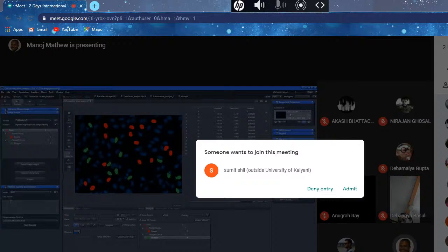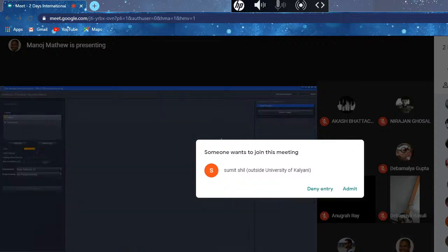So here I'm going to create a new training model and let me call it HeLa cells. This is my segmentation model. Here we are working a little bit differently. We are configuring the segmentation algorithm first before we do, let's say, pre-processing and other things. So the segmentation will be done using machine learning. So I'm starting the training process. I say start training, and it gives me this nice graphic user interface. I'm going to select a file.